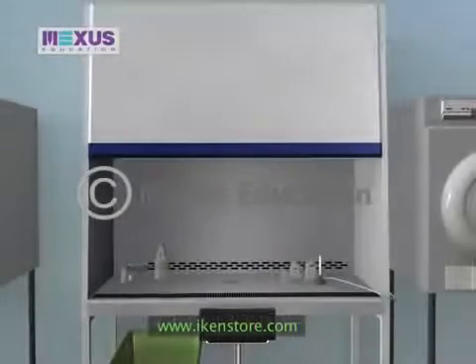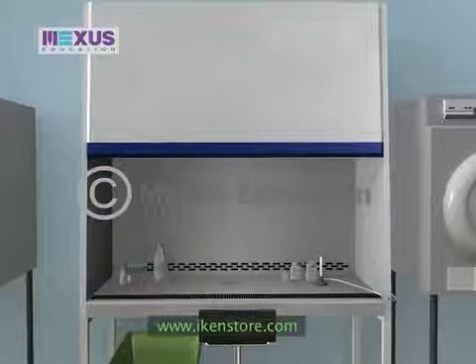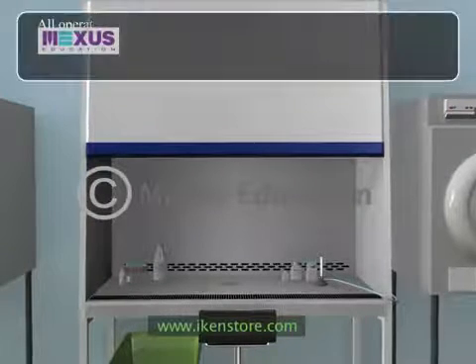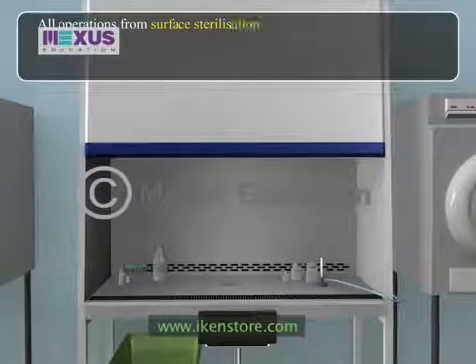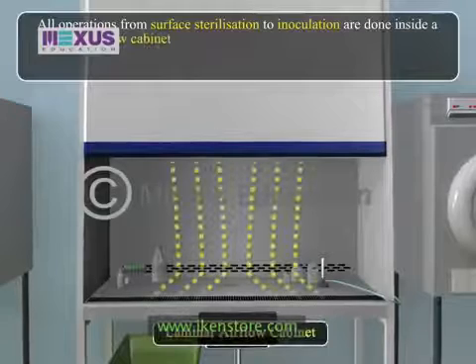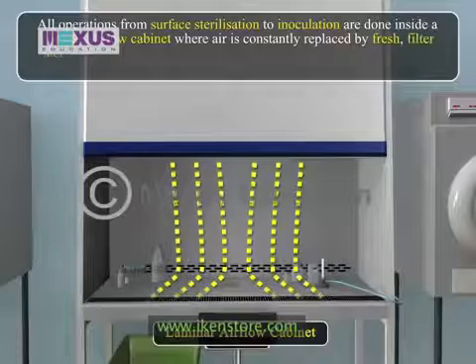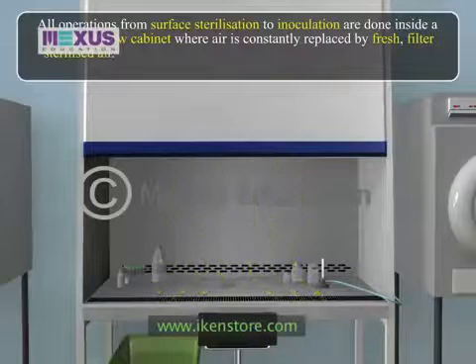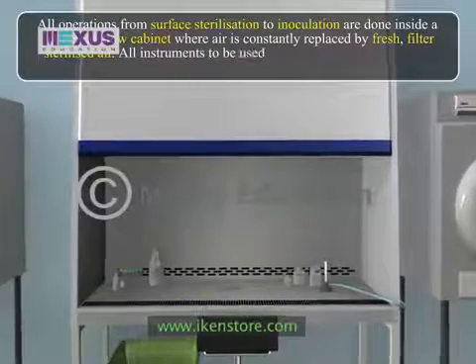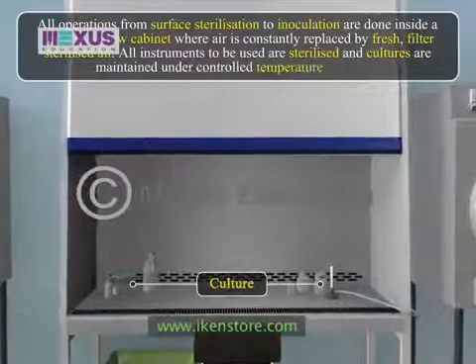The tissue is then transferred inside the culture vials in an aseptic environment. All operations from surface sterilization to inoculation are done inside a laminar airflow cabinet where air is constantly replaced by fresh, filter-sterilized air. All instruments to be used are sterilized and cultures are maintained under controlled temperature and light.